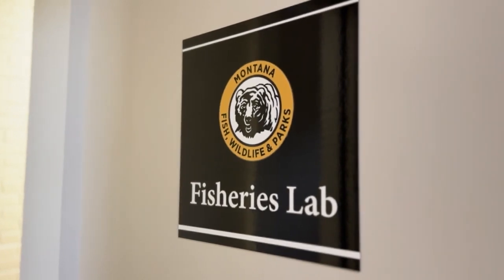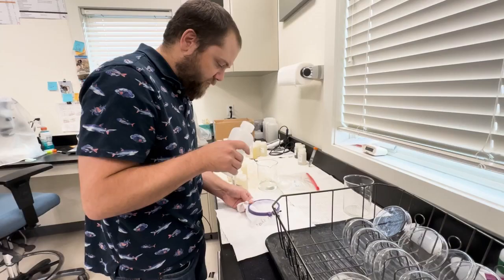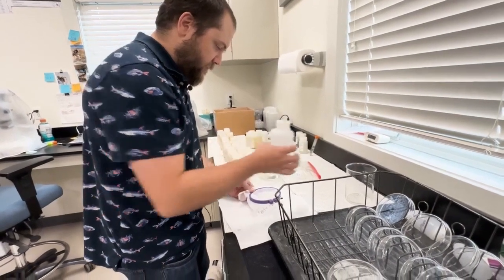A 63 micron net is drawn through the water column, and then that's all condensed into one piece.